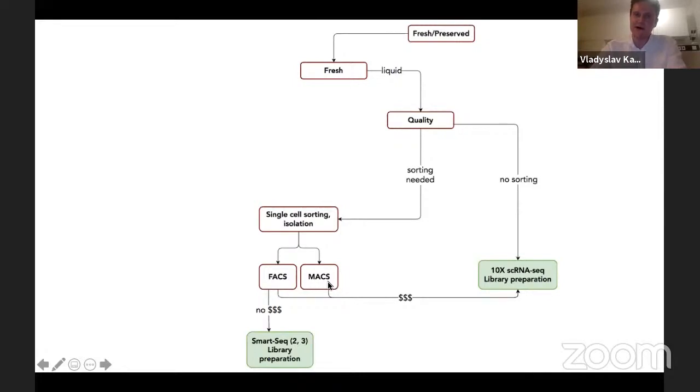And if you are using a negative enrichment, that means that you are sorting everything that is not bound by the antibody, it's even very good to use because you are not stressing your cells, yeah? When you are using negative selection with the help of MACS, that means that you are introducing much, much less pre-processing batches than if you would do it with FACS. But as I said, it's a matter of the question, yeah?